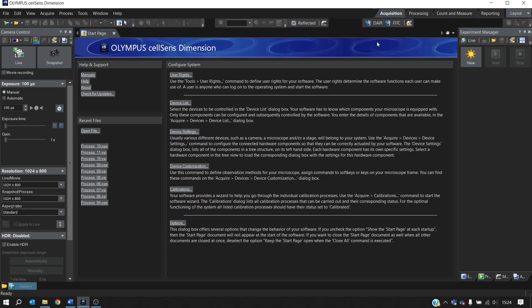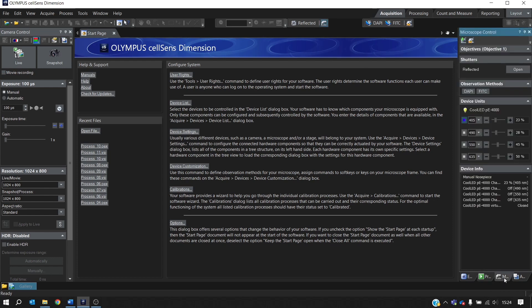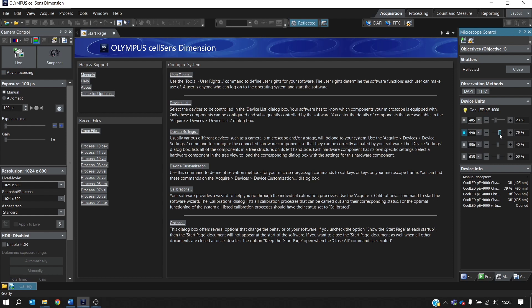If you do want to have the LEDs switched on when you're simply observing your sample without the camera, then what you need to do is go to the microscope control window here. This can also be accessed from the toolbar. You can open the shutter and then all the LEDs along here can be selected and the intensity controlled. And you can see the LEDs being controlled in real time. And your observation methods are also available from this window.